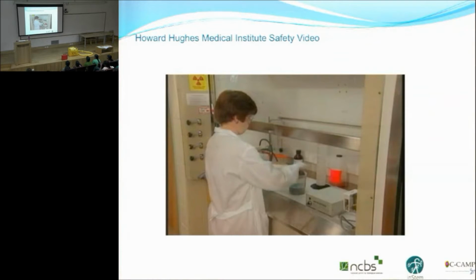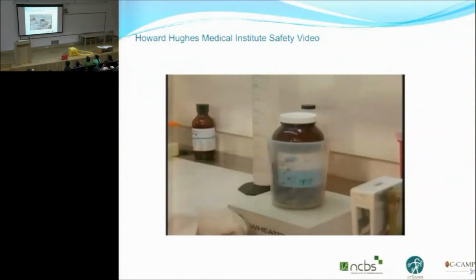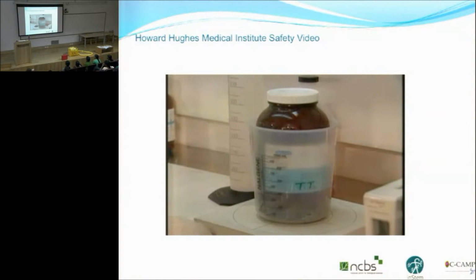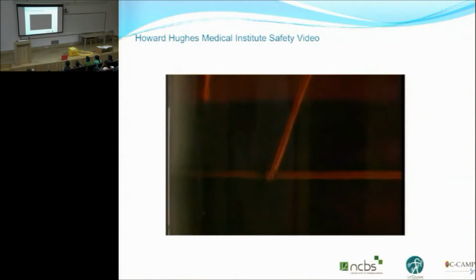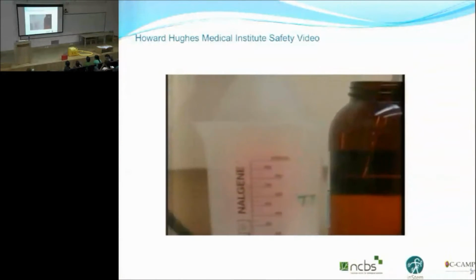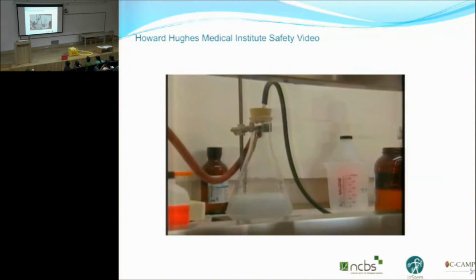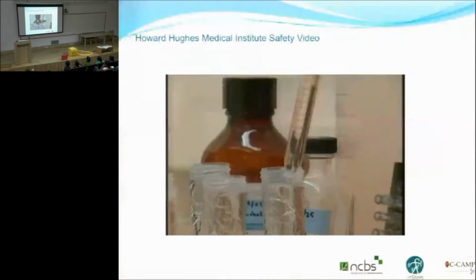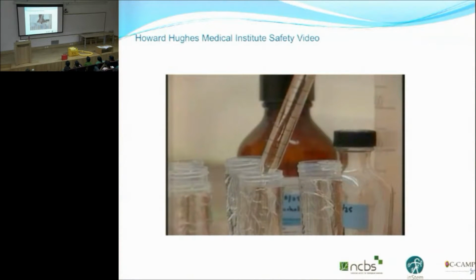Whenever hazardous chemicals are used, a lab coat, gloves, and safety glasses provide valuable protection. Be alert for the possibility of the stir bar cracking the bottle. A secondary container provides cheap insurance. Phenol is one of the more hazardous substances in the modern biology laboratory. Always consider safer substitute protocols as they are developed. To reduce risk of exposure, Gretchen avoids working with a large bottle of equilibrated phenol by preparing several small stock tubes.